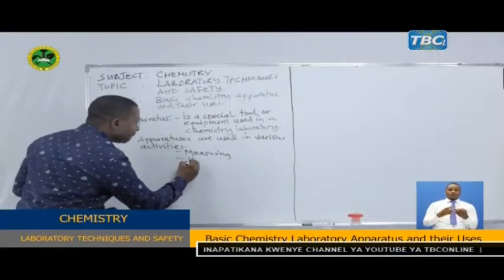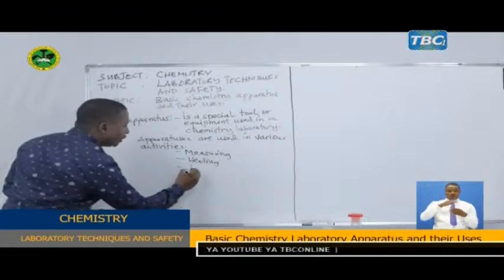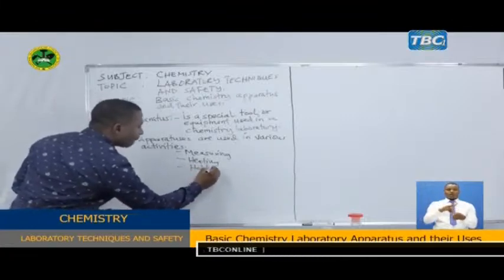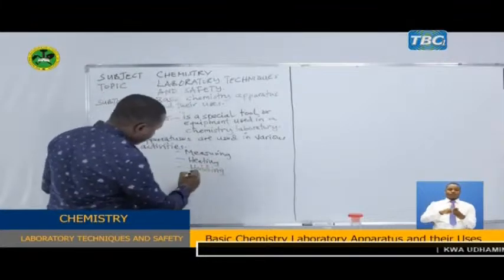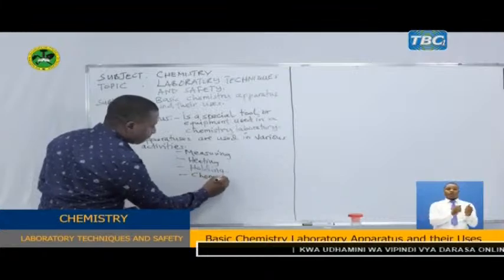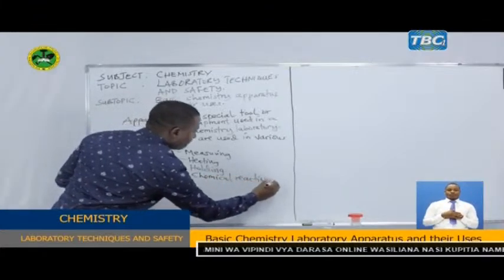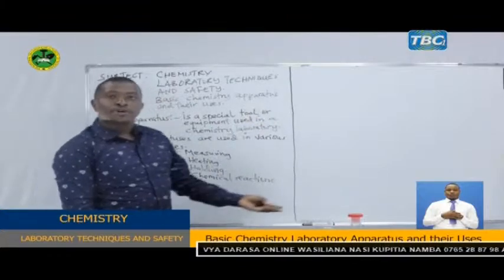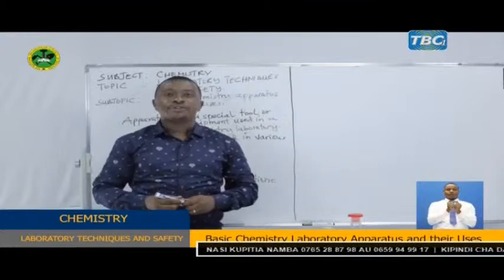in heating, can be used in holding, and can be used in chemical reactions. So those are the various uses of apparatuses in the laboratory.